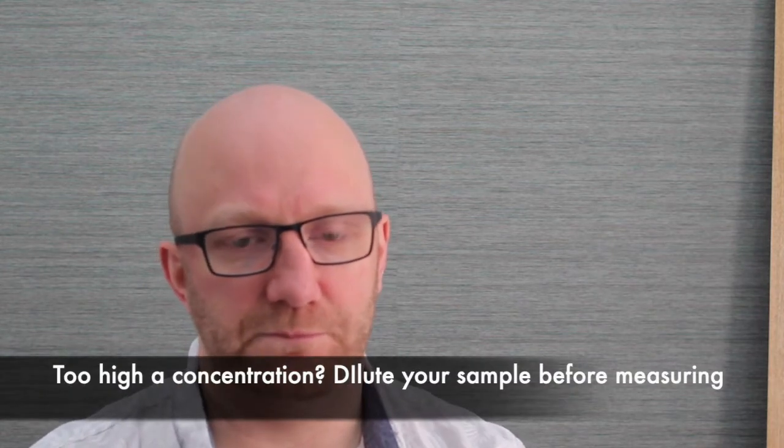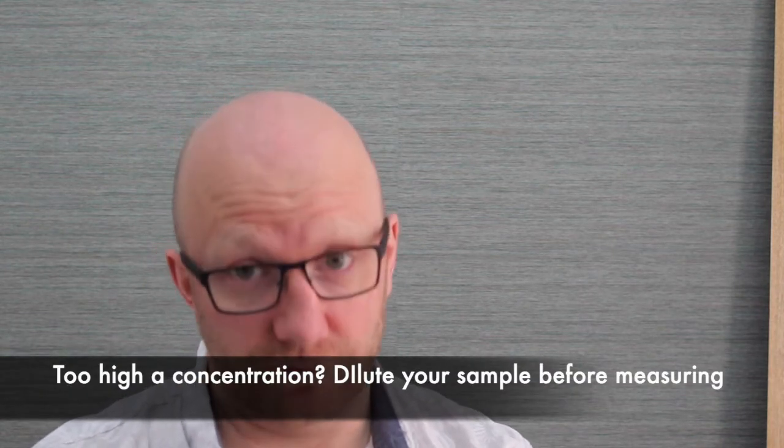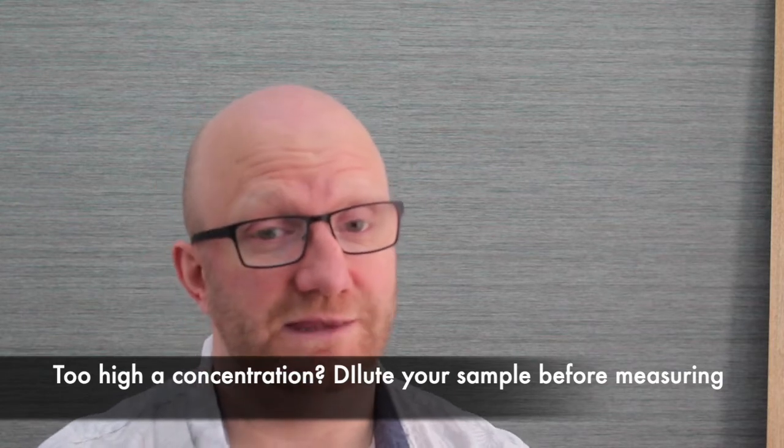Too high concentrations are less likely to be a problem. All you need to do is dilute your sample down to bring it back within range. Now, your local technical staff should be able to tell you what the dynamic range of your machine is. Okay, apart from the speed and low volume measurements, the other advantage of the spectroscopy derived concentration measurements is you also get an indication of whether your solution is contaminated with protein or phenols or not.